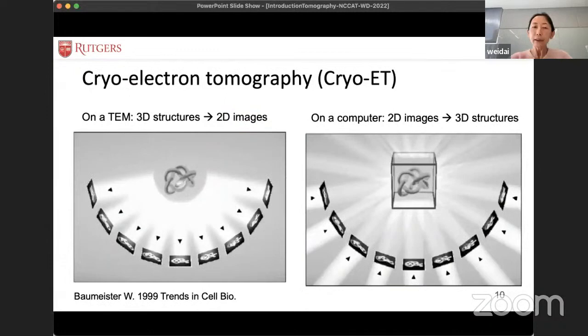On the other hand, for cryo-electron tomography, the sample could be purified protein complexes. It also could be, for example, an isolated organelle, enriched membrane fractions. It could be a bacteria. So it basically doesn't have to be homogeneous.